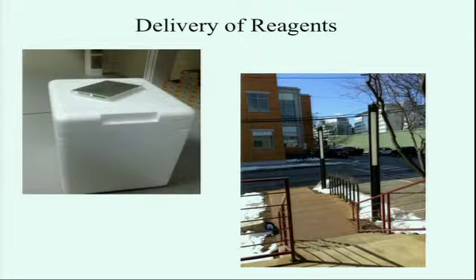Once the aliquots are all set, it's ready to be delivered. We can either deliver the glycerol stocks to our collaborators, or if the library DNA is ready, we can send it over to our virus prep team for virus to be made.